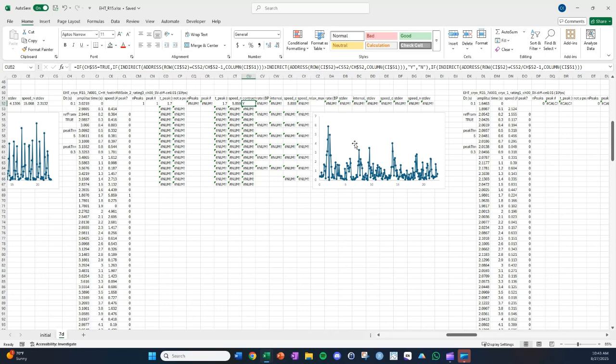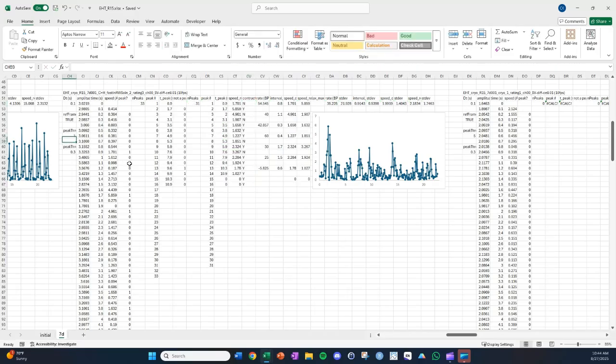I think clearly above the noise, in my opinion, are peaks here, here, here, and so on. And we'll get into analyzing the more difficult case, which is this one. I'm going to set it, I think the noise is kind of down here, so I'll set it at maybe 1. Let's start with a setting of 1 here. And you can see that changed drastically.